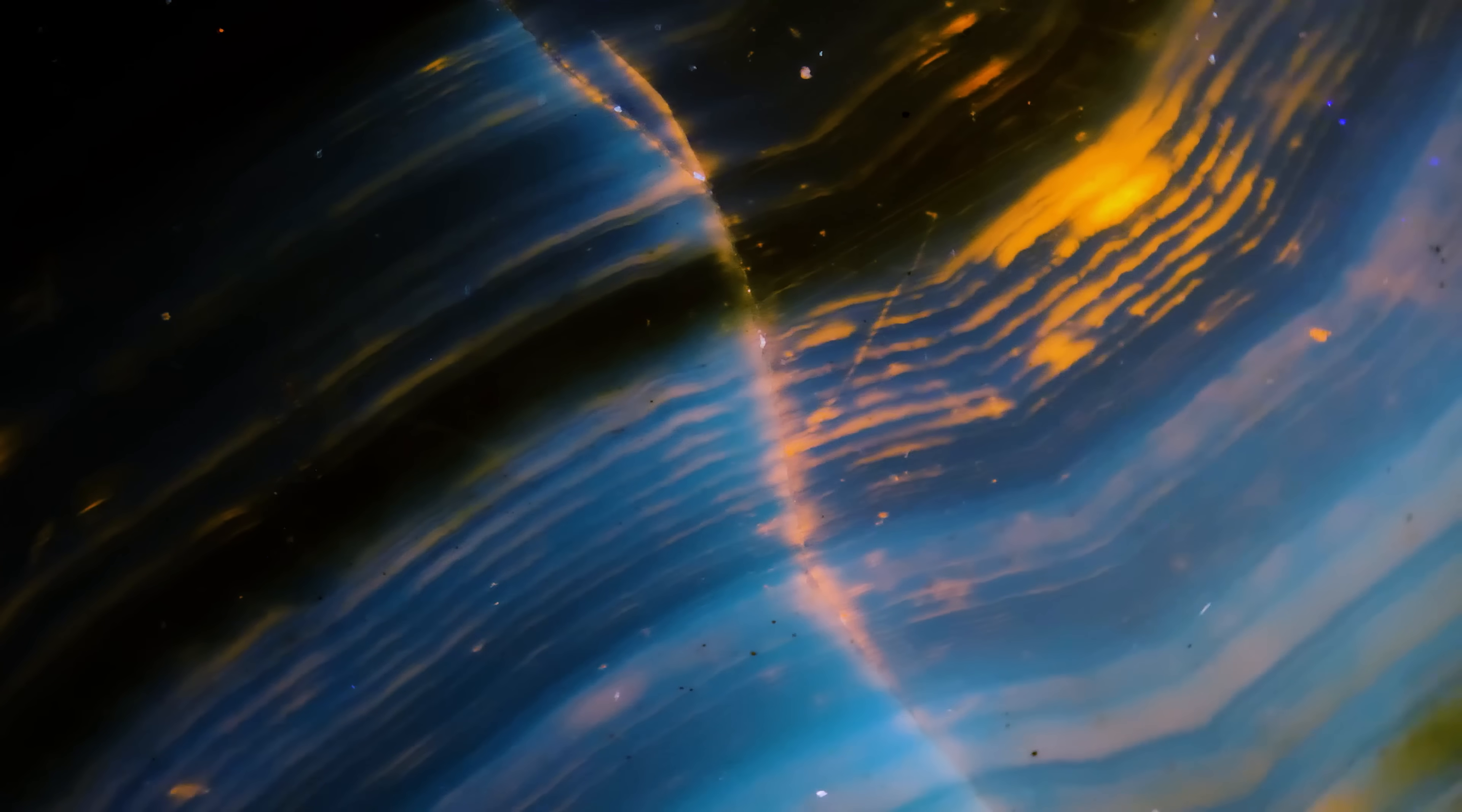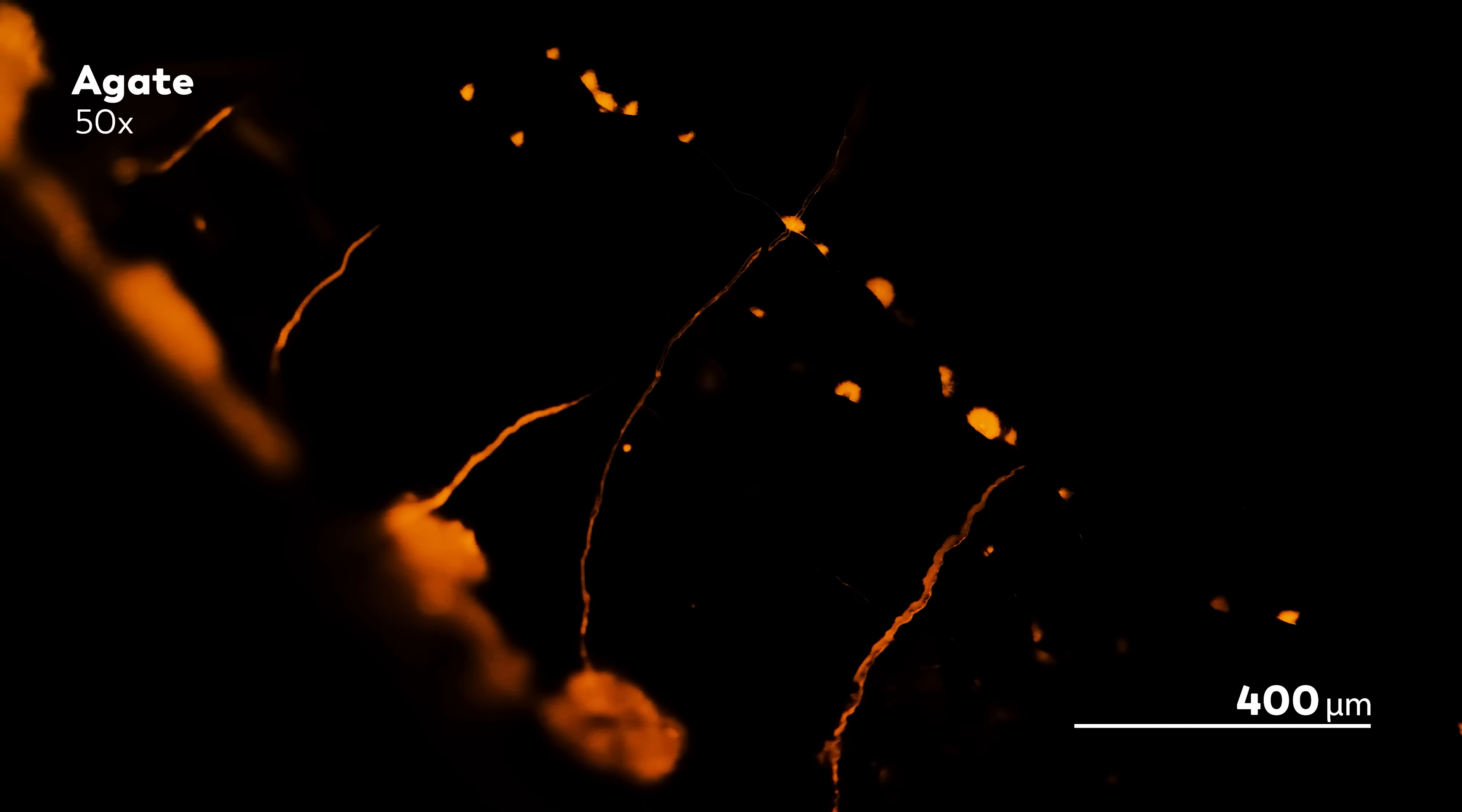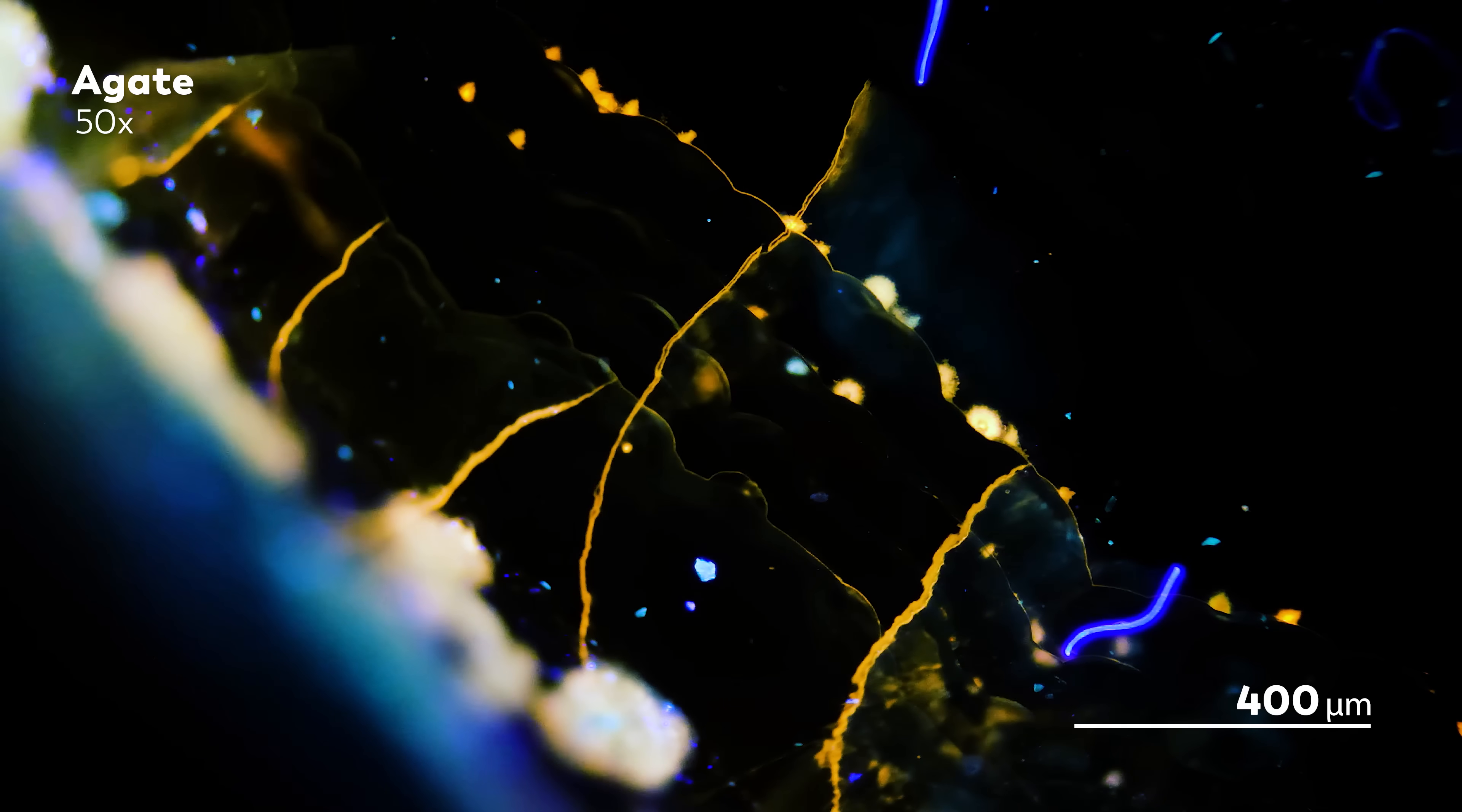And then, once you turn the microscope on, the details embedded in the geode become this gorgeous landscape with stunning layers and colors all splayed out. And when James turned on the fluorescent light source on his microscope, he was surprised to find that the slices show autofluorescence. After digging through some papers, he suspects that these bright bits are created by certain trace elements in the lattice of the geode.